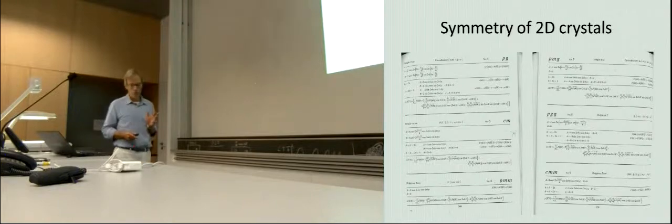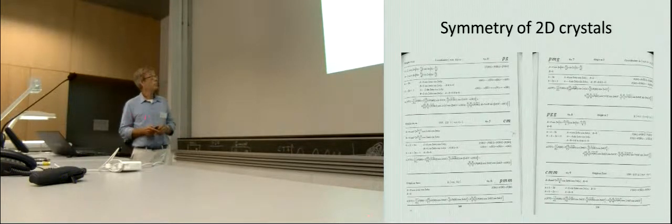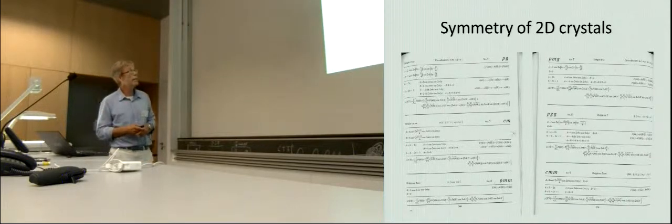and PG corresponds to a two-sided plane group with a screw axis along one of the lattice vectors. PGG corresponds to two perpendicular screw axes, and if we are not sure if we have PG or PGG, in that case it's very easy, because here we have the information that all the phases should be 0 or 180.